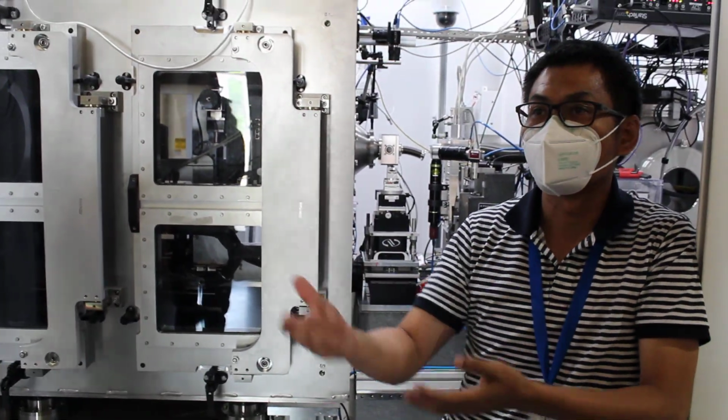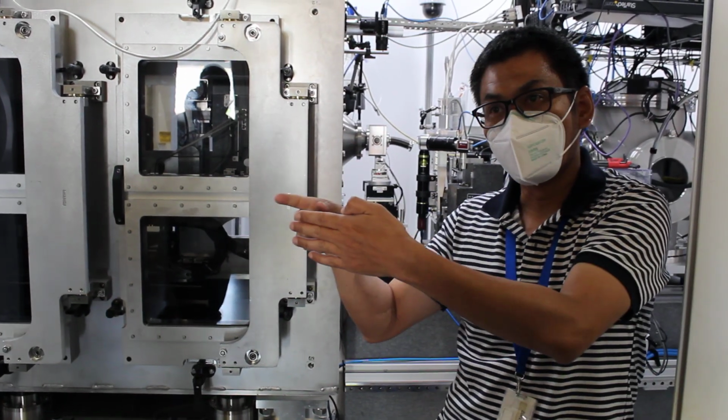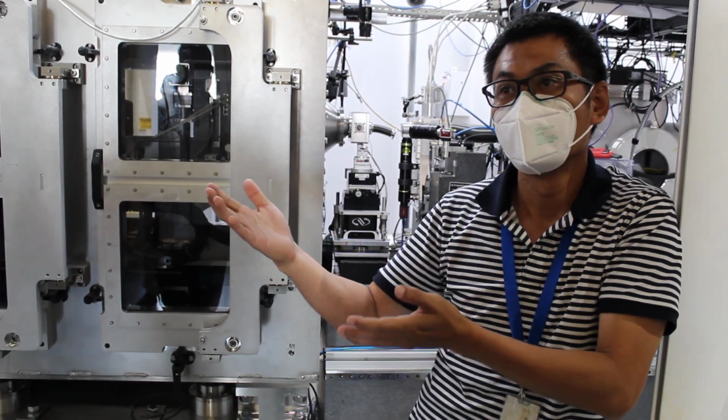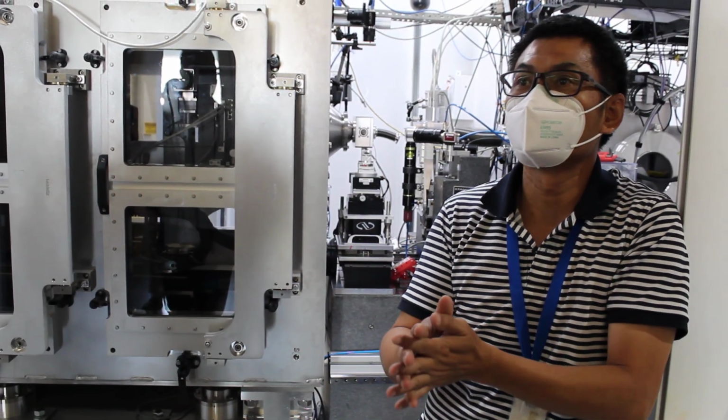Automated instrumentation flows the sample while it's flowing. You shoot on that, right? And so you use the detector to record what comes out, and from that you try to figure out what the structure of the solution is.